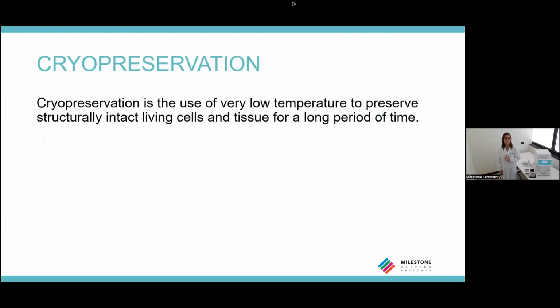So, what is the cryopreservation? The cryopreservation is the use of very low temperature to preserve cells and tissues for a longer period of time. Basically, at low temperature, samples are maintained in a state of suspended animation, so they are blocked and still, while their structure is preserved, so that when they are brought back to living temperature, the cell can work again, can make their function, so they can come back to life.